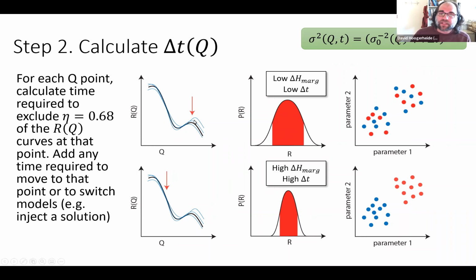But yes, the reason you don't want to be too aggressive is that, especially early on in the measurement, where you haven't really learned the structure of the problem yet, that may not be your best place to measure. So you want to spend a small amount of time there, and then return to it later, after you know more, if that actually ends up being a better parameter. The algorithm just does this all on its own. But you're right that you are going back and measuring over and over again, sometimes in the same point.